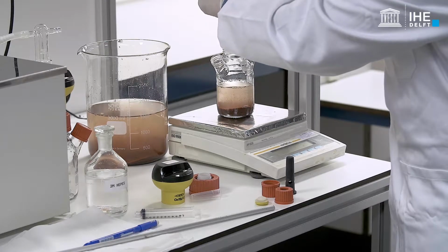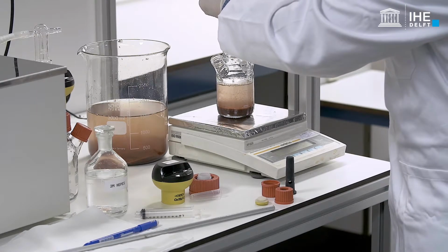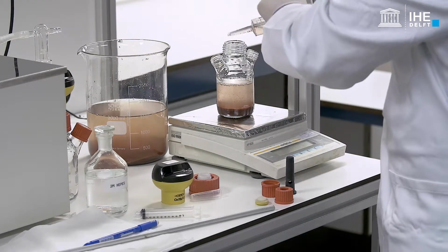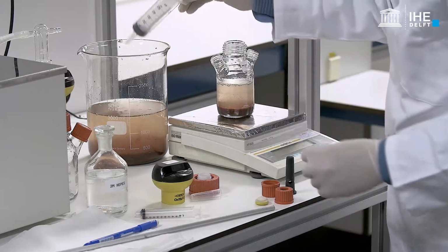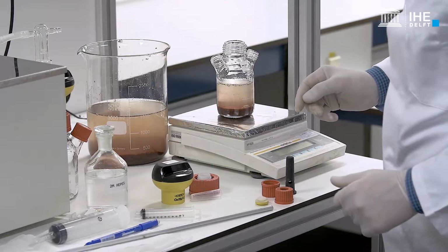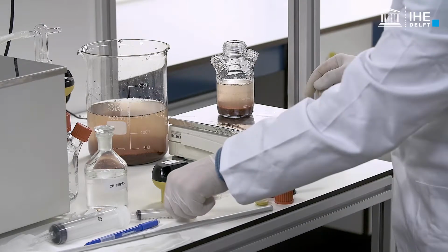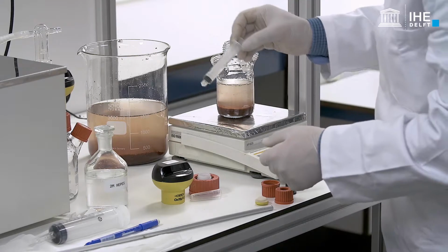The total volume of the closed reactor vessel should be known precisely in advance in order to calculate the headspace volume by the difference with regard to the sludge volume poured into the vessel. In this case, the total volume of the reaction vessel is 0.329 litres, and thus the headspace volume resulting after sludge addition corresponds to 0.129 litres.